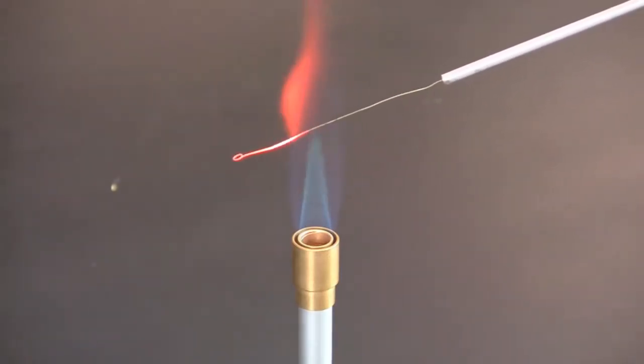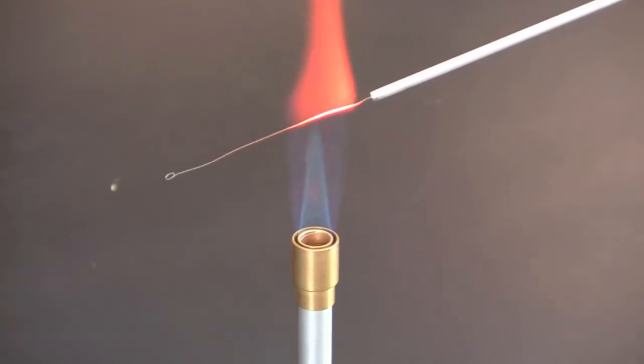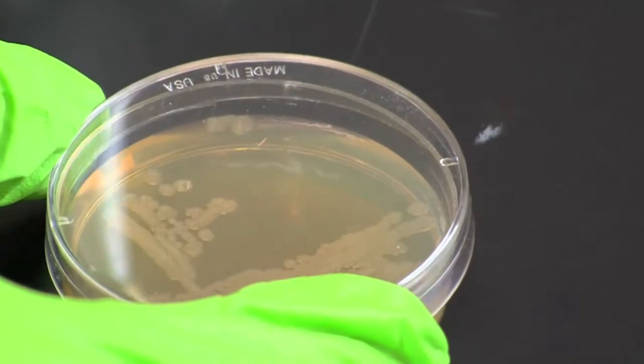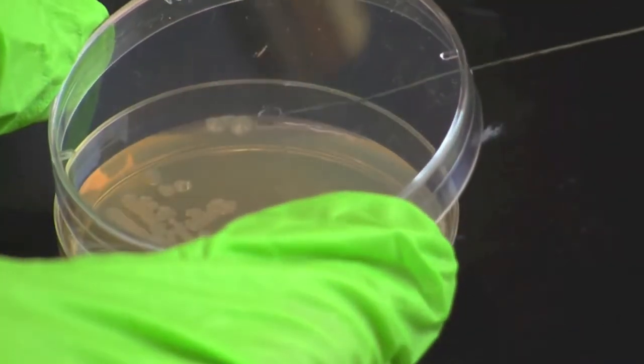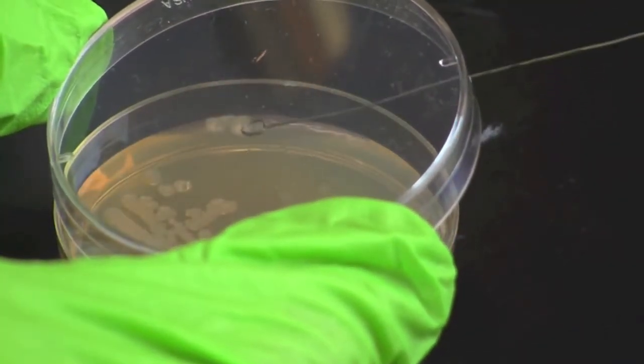Flame an inoculating loop to sterilize and allow it to cool. You can lightly touch the loop on an empty spot on the bacterial plate to make certain the loop is cool.